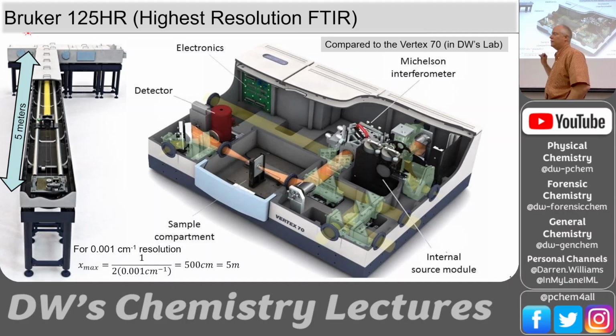This is a really interesting spectrometer because it's got lots of places where you can put attachments. Like we have a microscope on here, but you could have other kinds of detectors. It's very versatile.